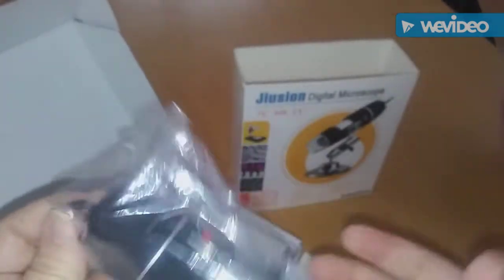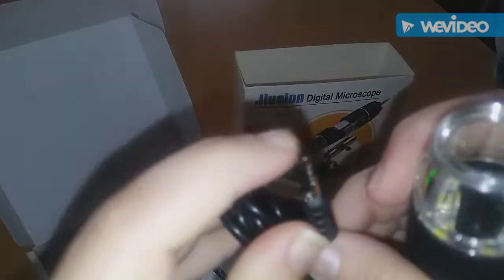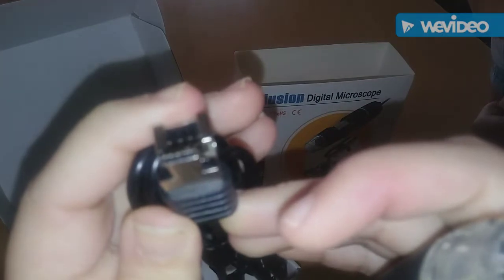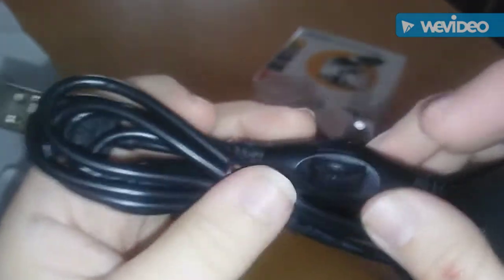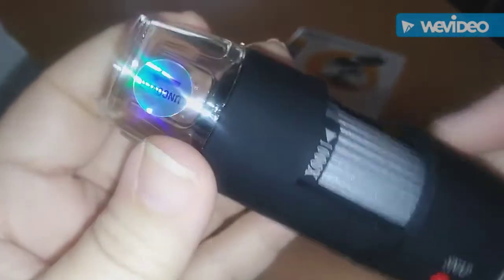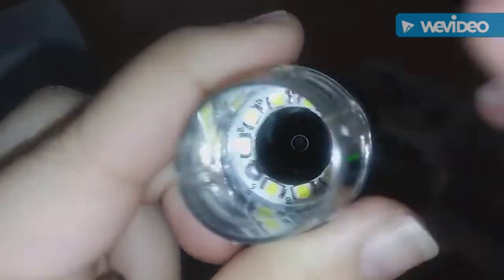So this is what the camera looks like. I always put it back in here — I don't want the lens getting dirty or anything. This part here goes like that or it can go like that, and you can put this part into your phone. That part goes into my Android phone. To turn the light on, you have this right here — it makes it brighter or dim. When you're using it, be sure to take the cap off so you can see. That is the camera in there, the lens and the light around it.